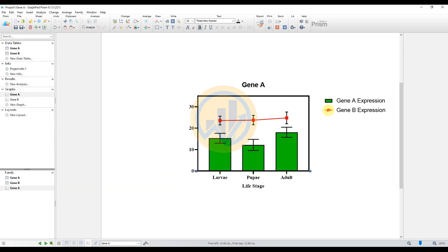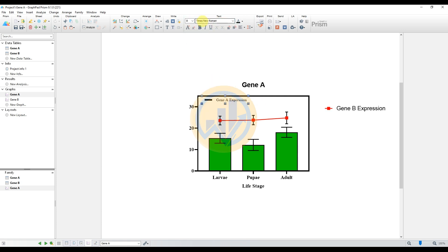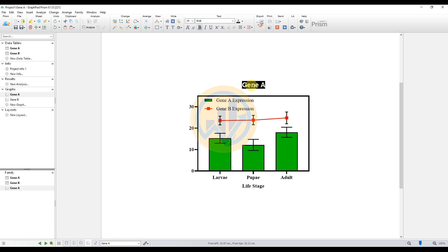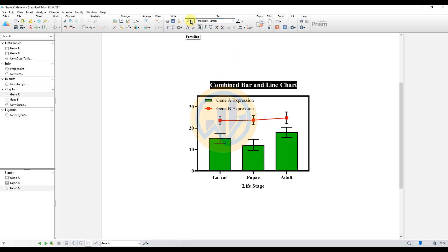Click OK, then move to the legend options for Gene A and Gene B. Change the font type and font size for both legend entries to Times New Roman, size 10. Add the graph title and enter 'Combined Bar and Line Chart' as the title. Select the title and change the font type and font size accordingly.